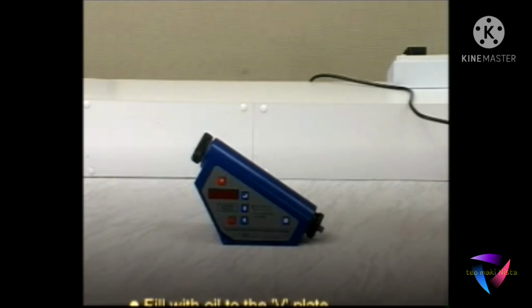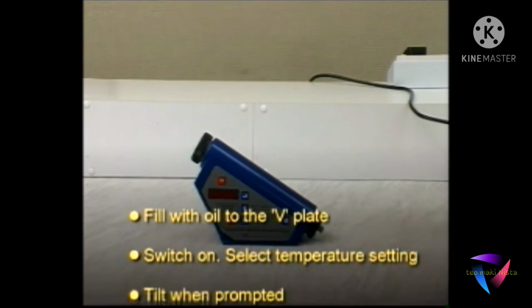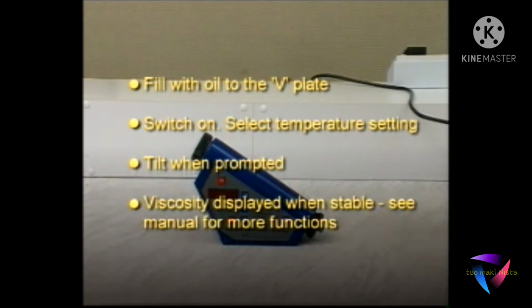To summarize, fill with oil to the V-plate, switch on, select temperature setting, tilt when prompted, viscosity displayed when stable. See your manual for more functions.